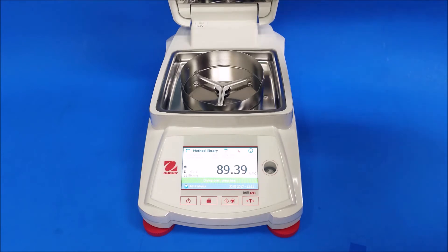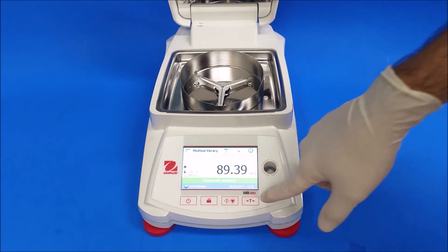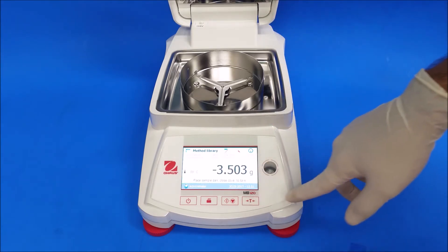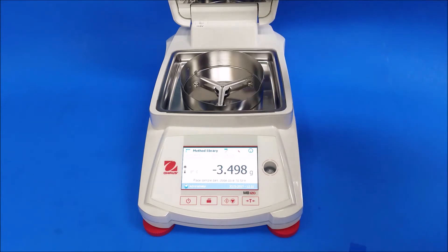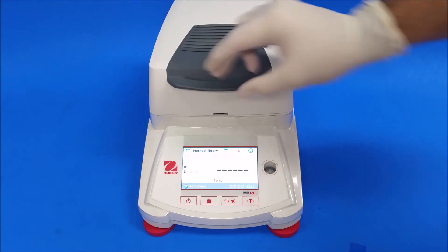And if you're going to run another test, this is when you press the tare button here. Once you put a new aluminum dish and close it, it's going to tare. It tares by itself.